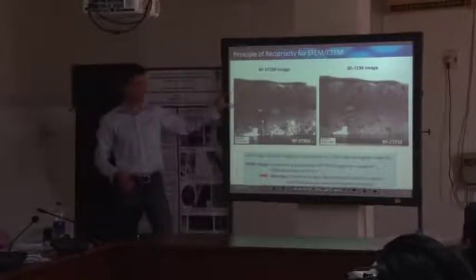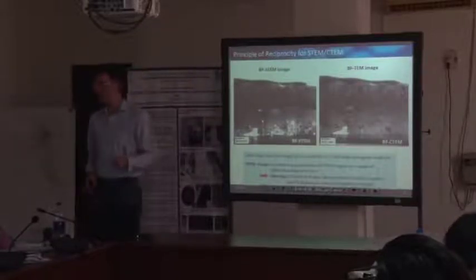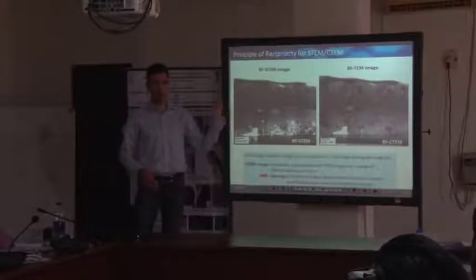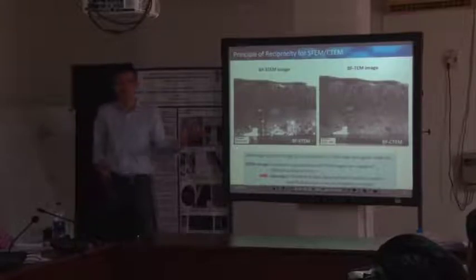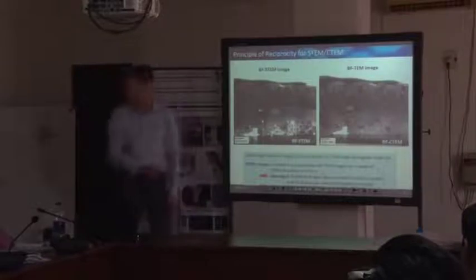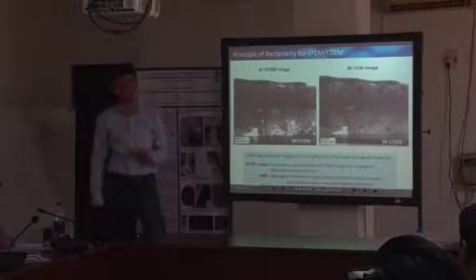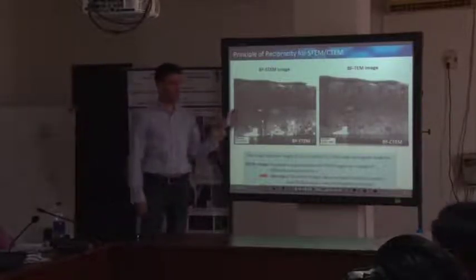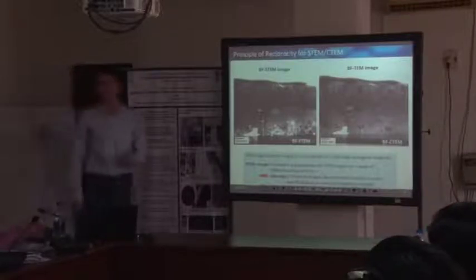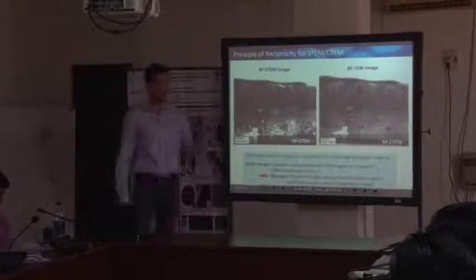It is zinc oxide, and all those grains are zinc oxide. If you get a pure Z contrast image, you will not get any insight into the polycrystalline morphology of the film. This is the first question that we want to address: we want to see how the layer grows. Finally we might be interested in atomic resolution or the local chemistry, but first the question might be the morphology of your deposited film. This is what you see in angular dark field or bright field, but you will hardly see that in Z contrast imaging.